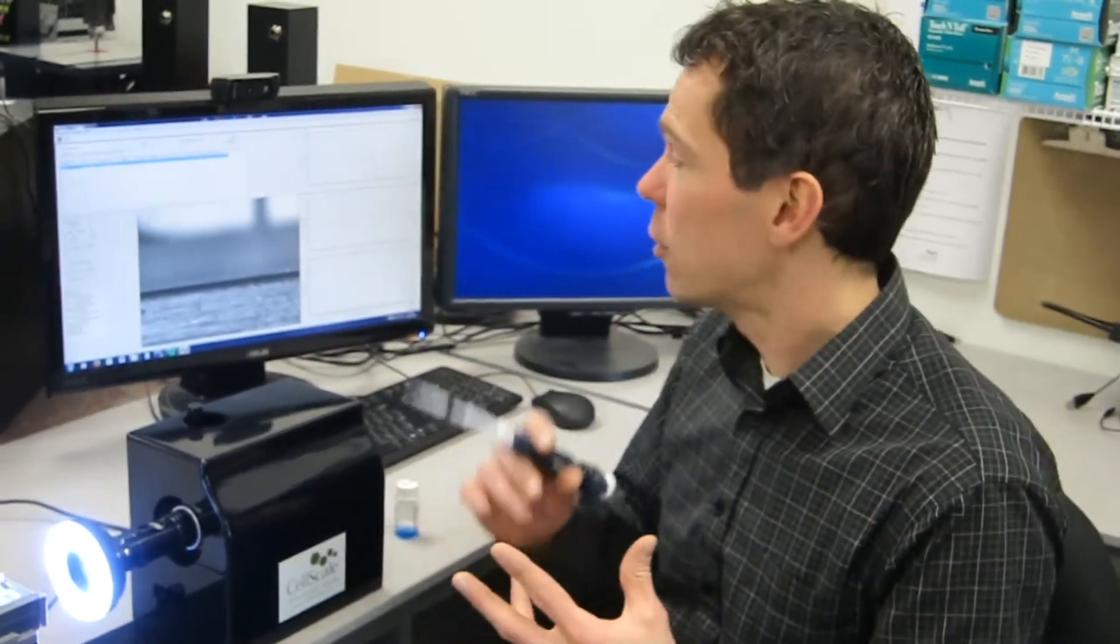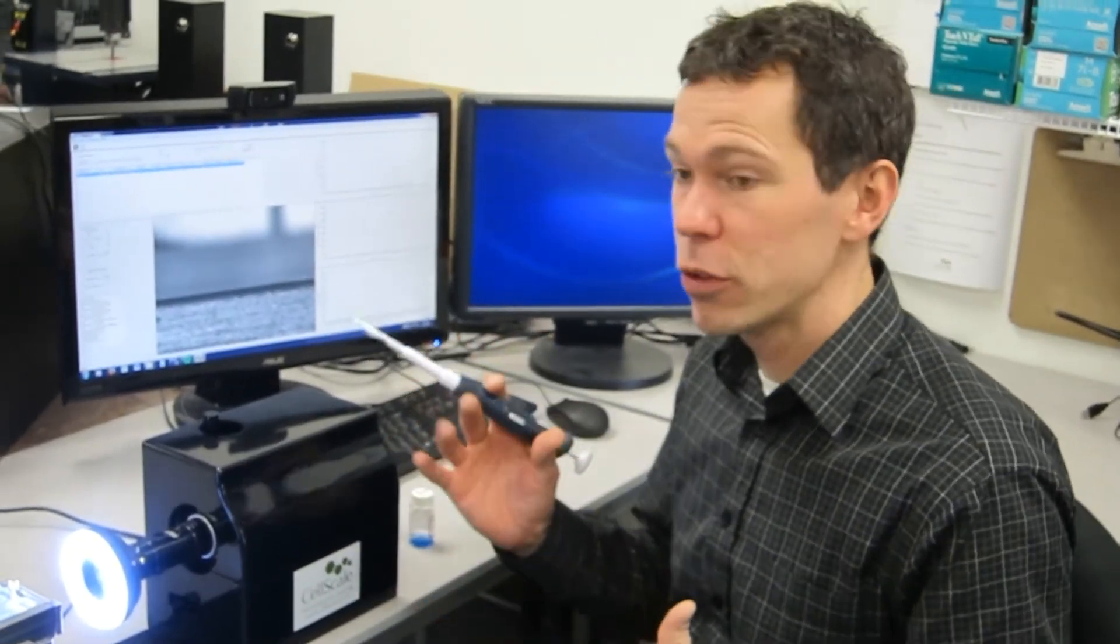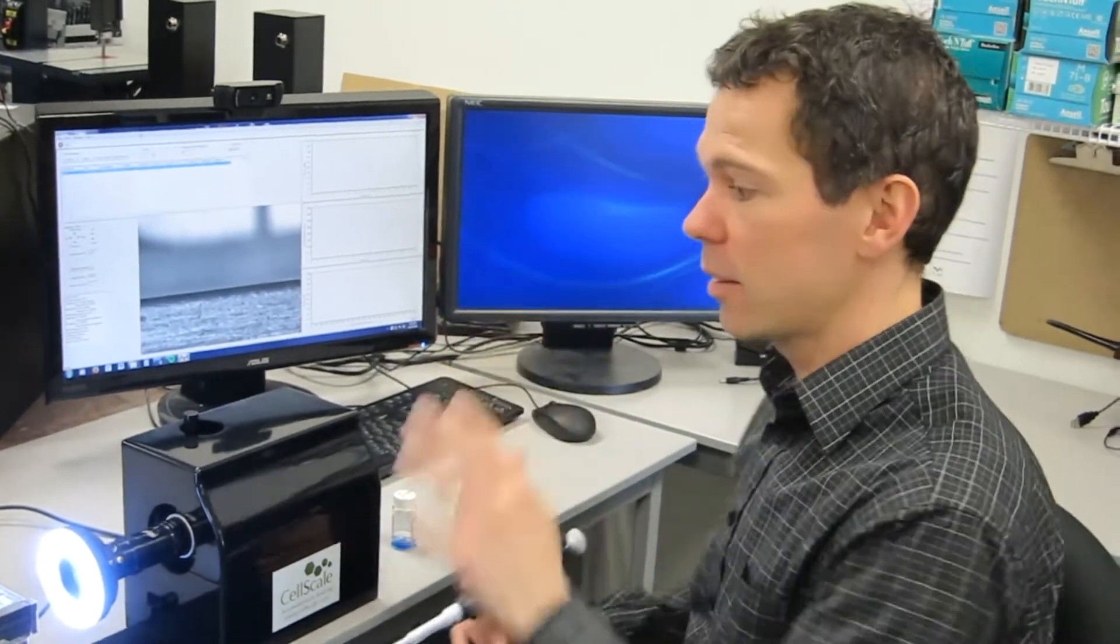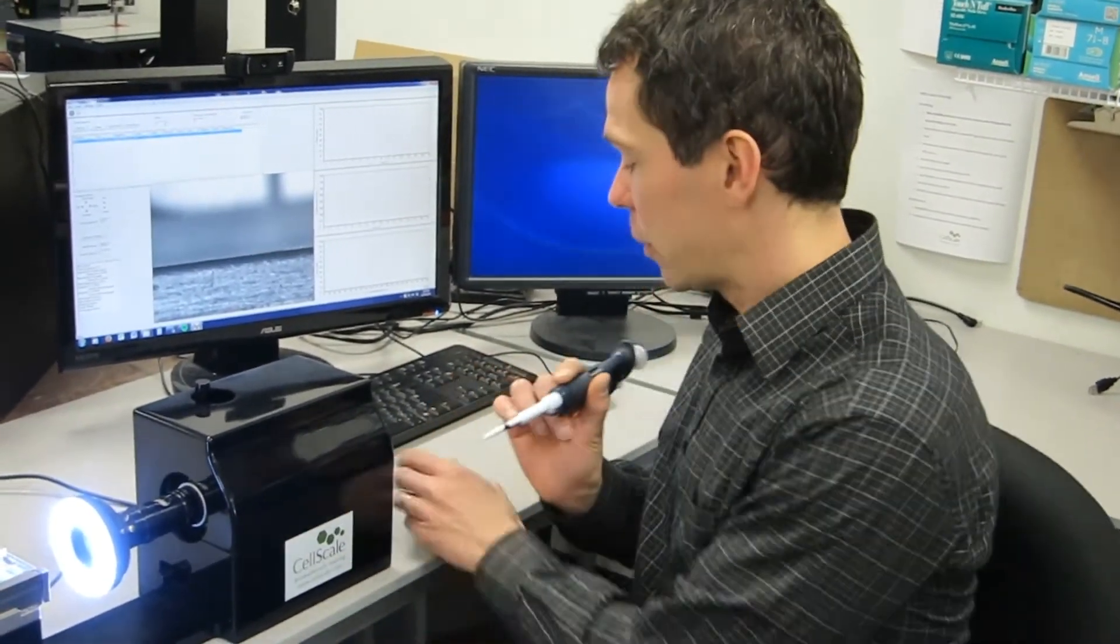So just to introduce you to how to use it and how it works, I have some samples here and I got the system all set up to go. So just a short video to introduce that.